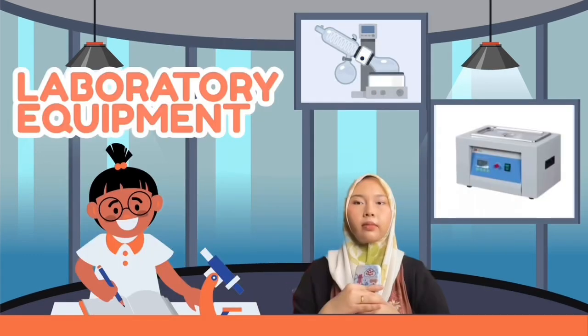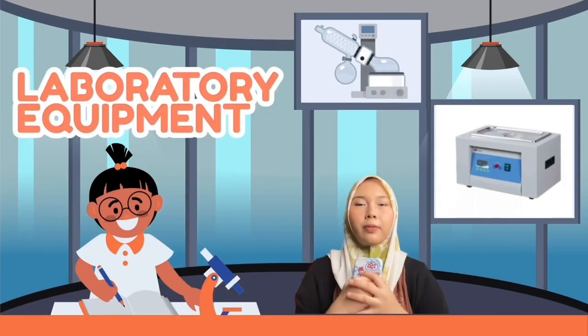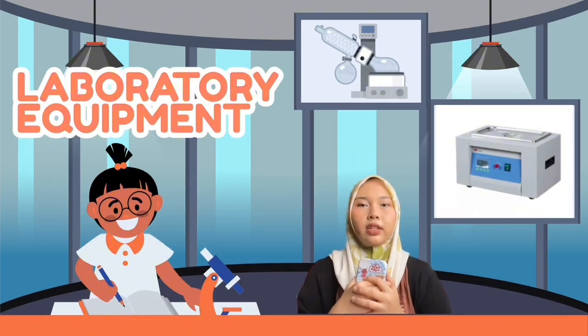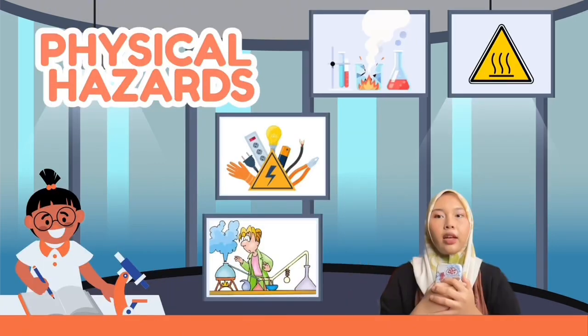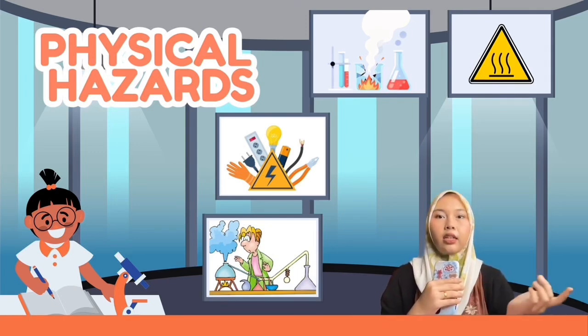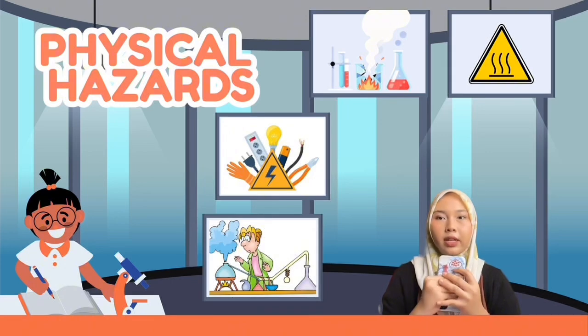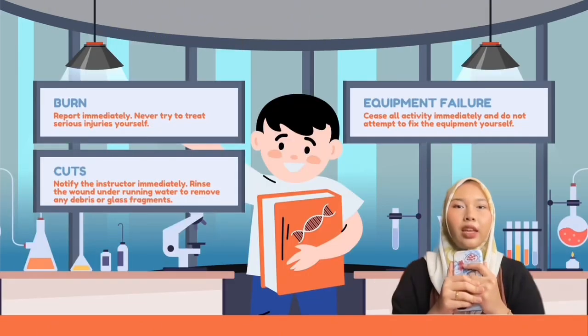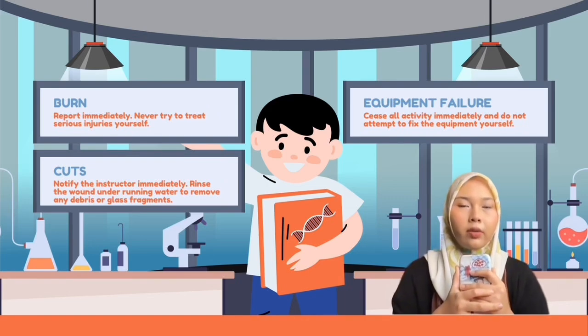This image shows laboratory equipment commonly used in applied science lab, such as a rotary evaporator and a heating bath. While this equipment is essential for experiments, it also presents physical hazards. This includes hot surfaces, glassware breakage, electrical stress, and pressurized systems. If the equipment is not handled properly, it can cause burns, cuts, or equipment failure.